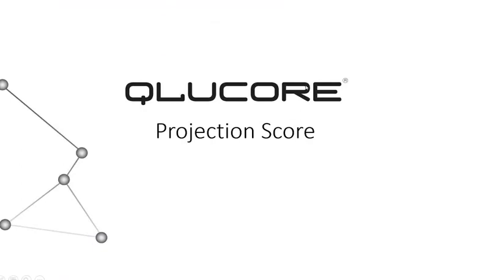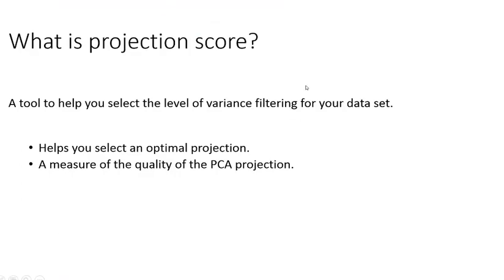So, projection score. What is projection score? It's a tool and a concept to help you select the optimal level of variance filtering for your data sets. Often, for example, in the world of microarray data analysis, you get a lot of high-dimensional data.